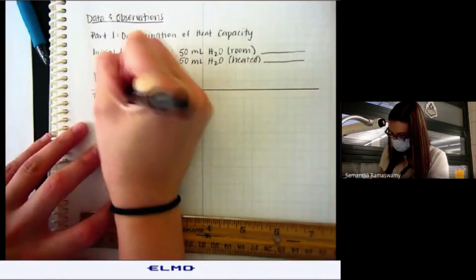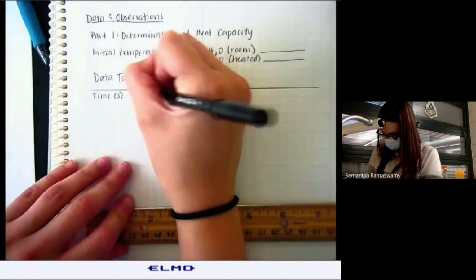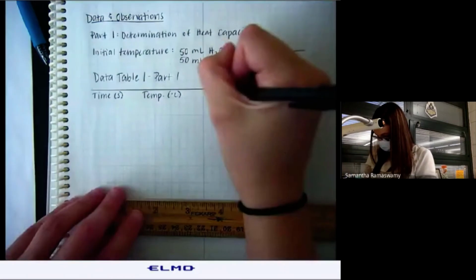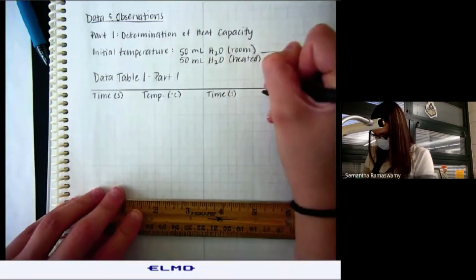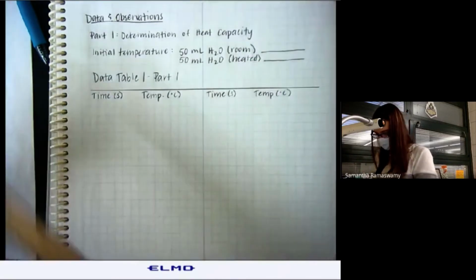So time in seconds. Temperature in degrees Celsius. Yeah, this will be fine. Time in seconds. And temperature in degrees Celsius.